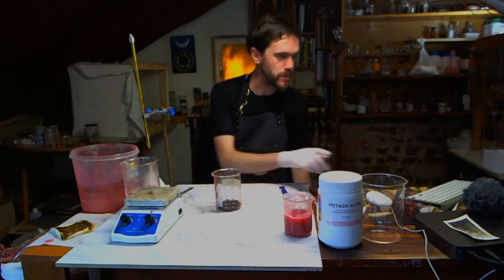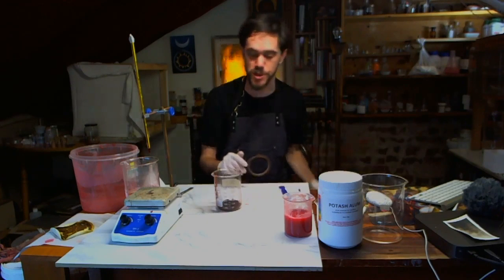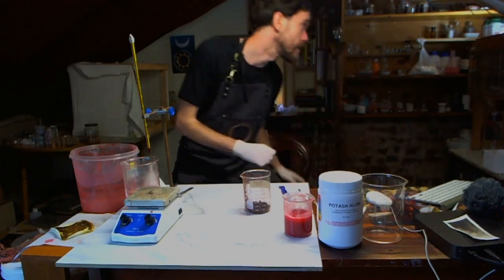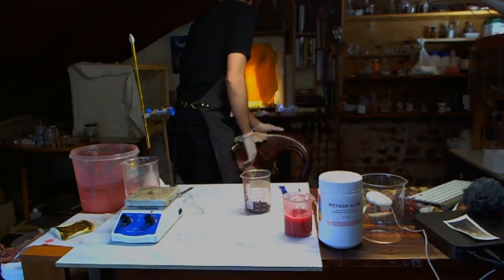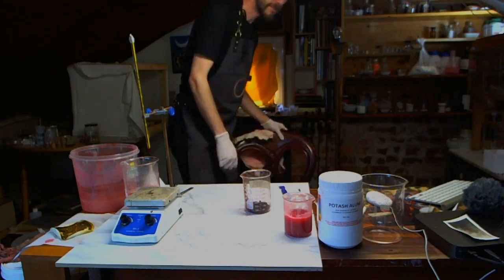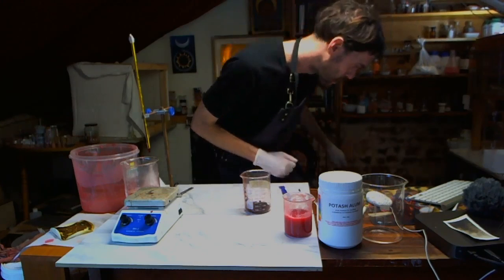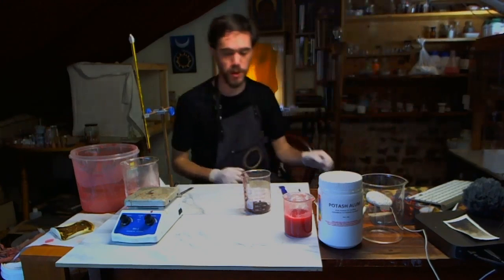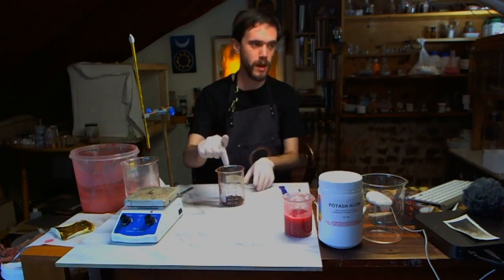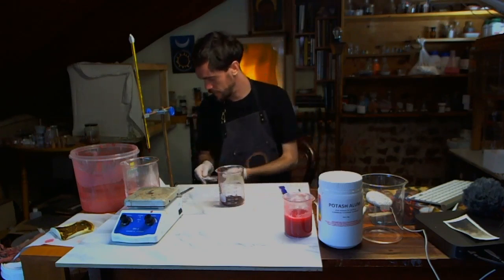Alright, so what's the next step with this? Oh, we need a boiling solution of alum. So we'll get ourselves another beaker. I'll just put the kettle on to boil, and then we're going to put in 9 grams of alum.